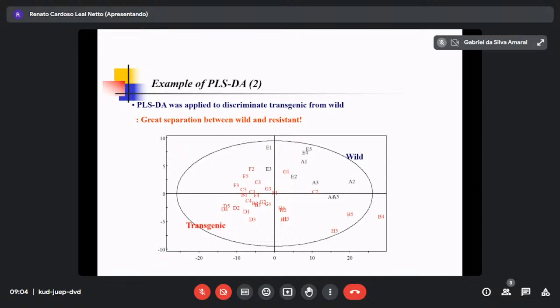When I use normalization and scaling, we are talking about comparison between samples. But in practice, those comparisons depend on the repeatability and relevance of my analytical test.